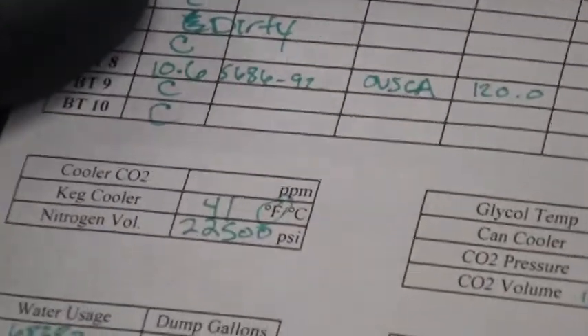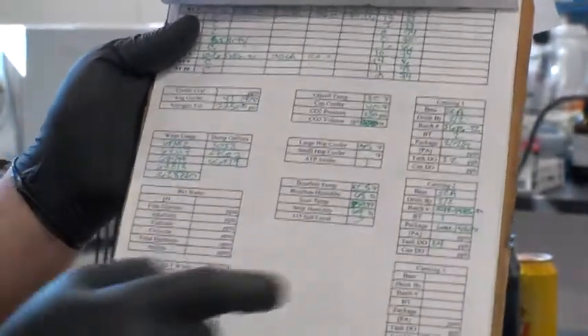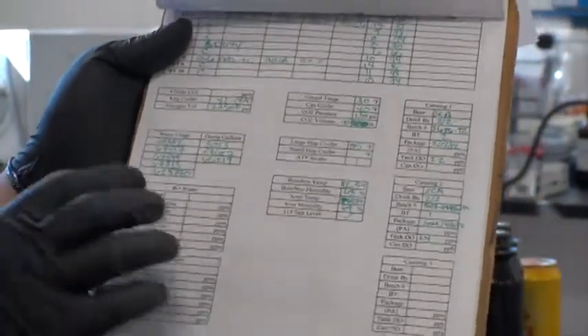The second page covers bright tanks with a similar setup. We have different metrics there: CO2 levels, cooler temperatures, water usage, glycol temperatures, hop cooler temperatures, all these different things. Canning line information. For brewing, we check water quality — we covered water previously in the last class — and that information goes here as well.